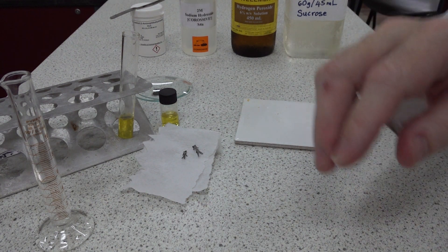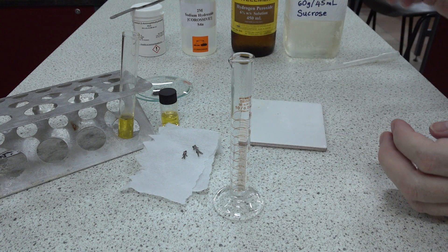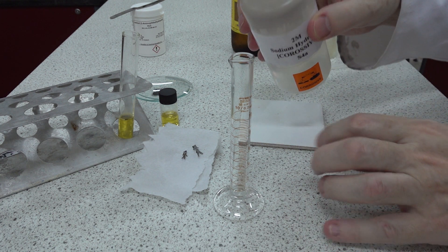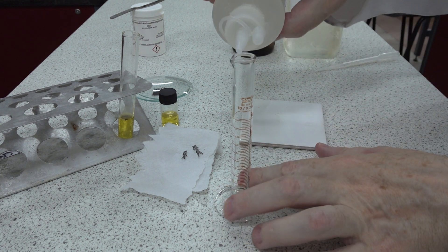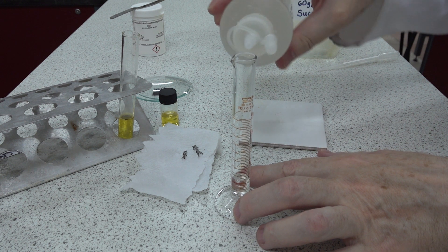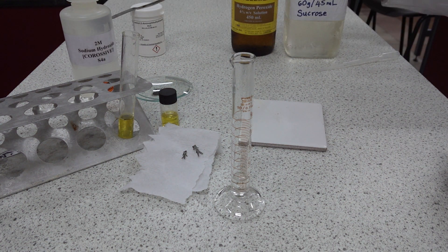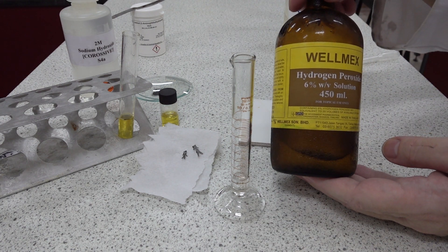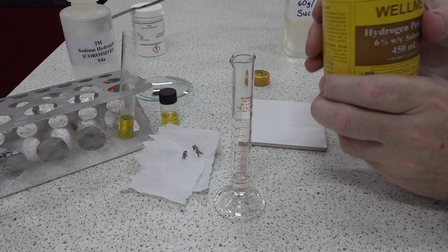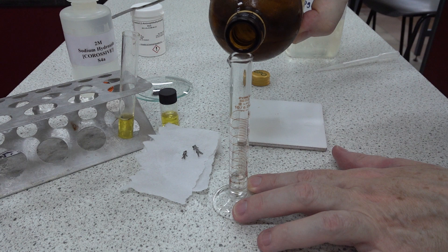Next, we take the diving chamber — that's a 10 centimeter cubed measuring cylinder. Into the bottom we put about two centimeters cubed of 2 molar sodium hydroxide. It's not essential to get exactly two centimeters cubed. We then add about two centimeters cubed of hydrogen peroxide from the pharmacy — a six percent solution — approximately doubling the volume to about four centimeters cubed or thereabouts.